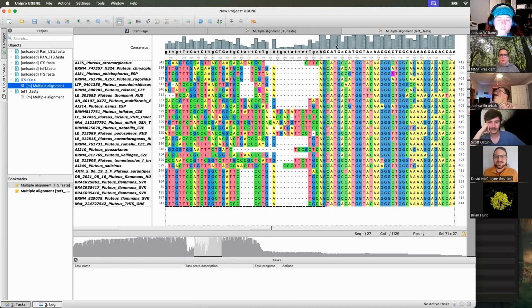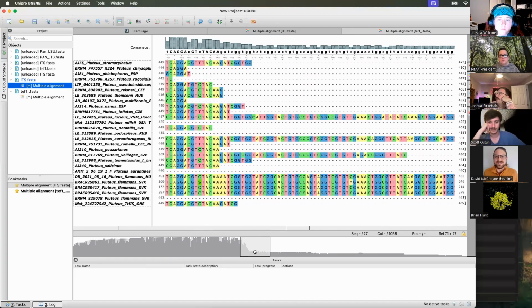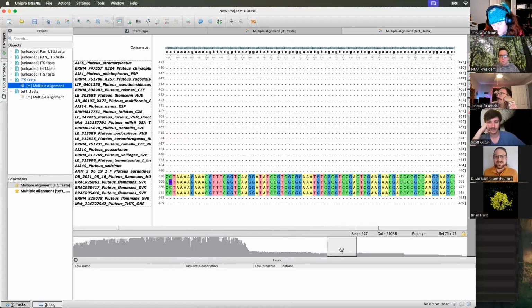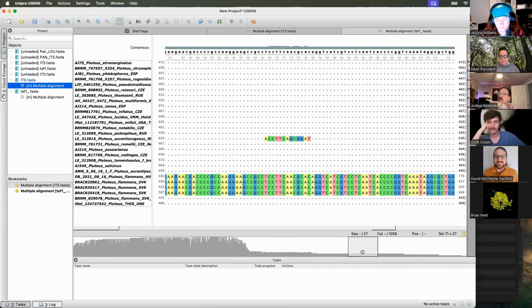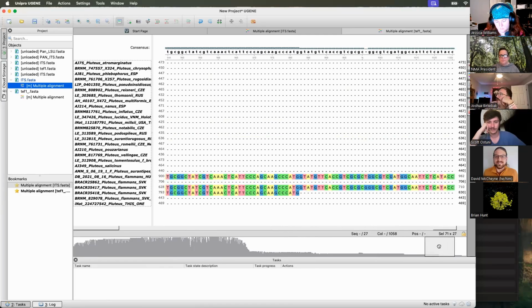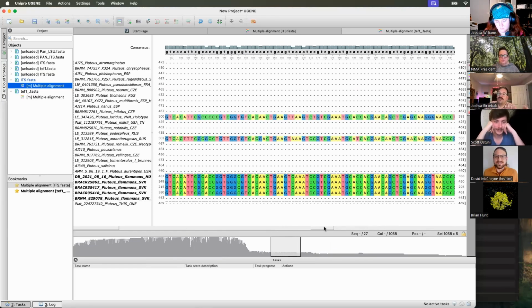And remove it. And then here we have a decision to make. We have some of these sequences that are much longer reads, and that's just random noise. Ignore. Sometimes the alignment software has really weird problems where it'll put one weird little flanking chunk way away when it really should be pulled all the way back that way. We're going to exclude this all anyways, especially because this is all one species, so we're not getting any really useful information from having all of this long string of information.